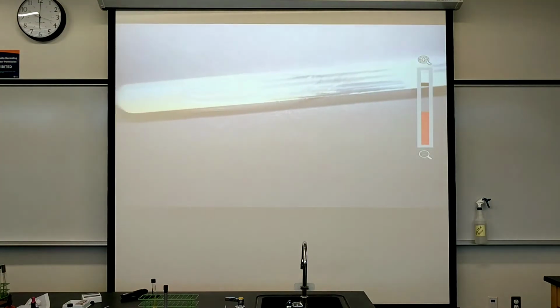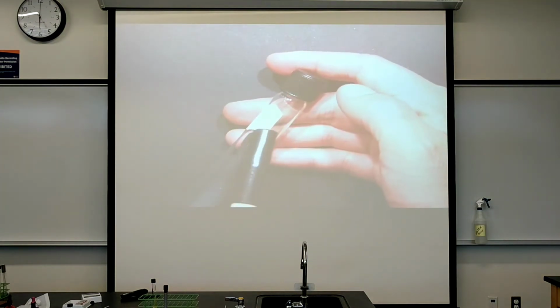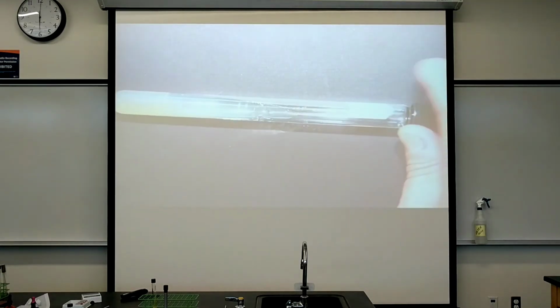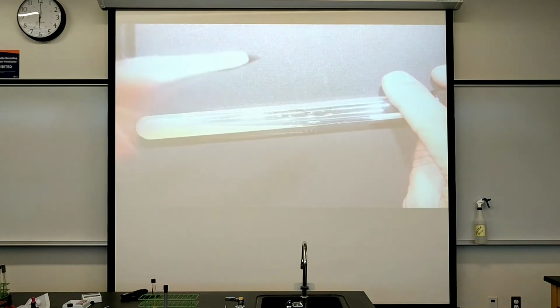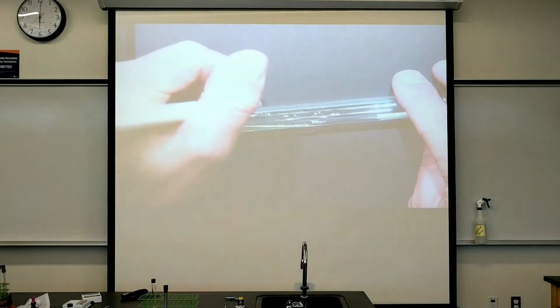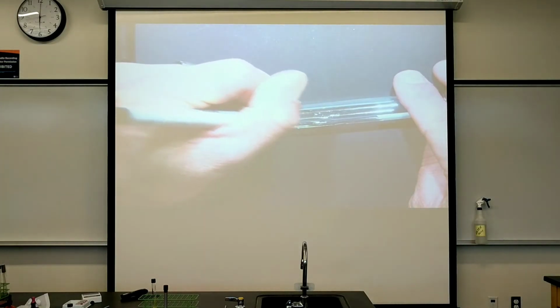All right, now, it's really zoomed in. Okay, so here's the area for labeling that we're not going to use. We're just going to go onto the bare glass, and it doesn't matter exactly where we do this. I'll just maybe do it right here, and I'm going to put C. freundii.